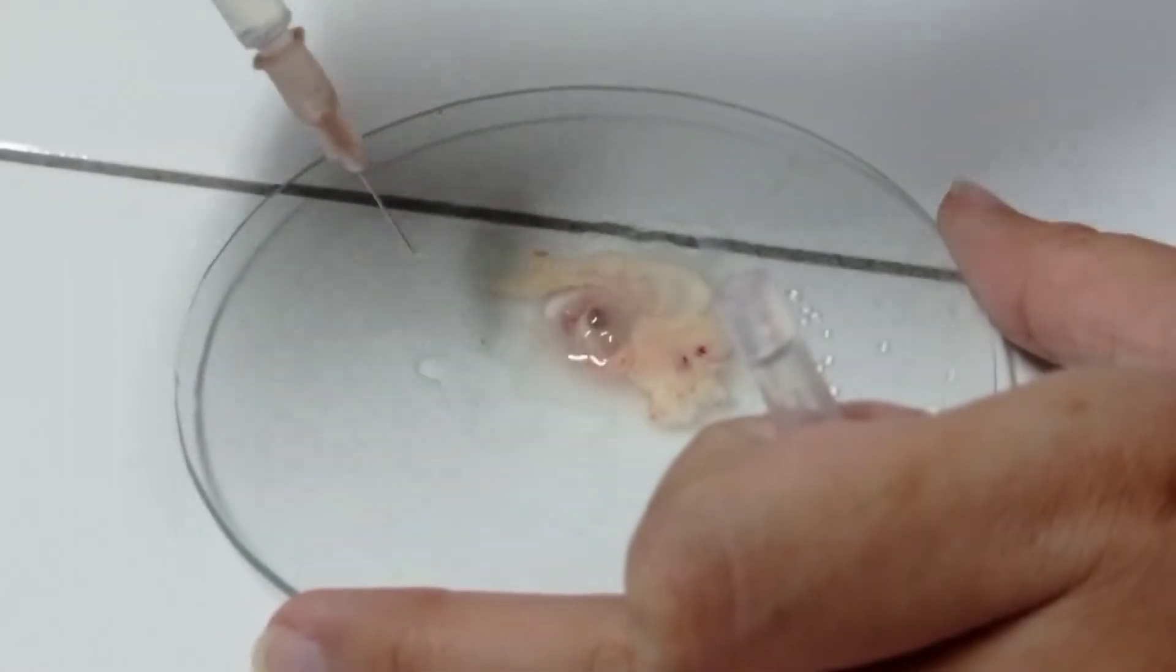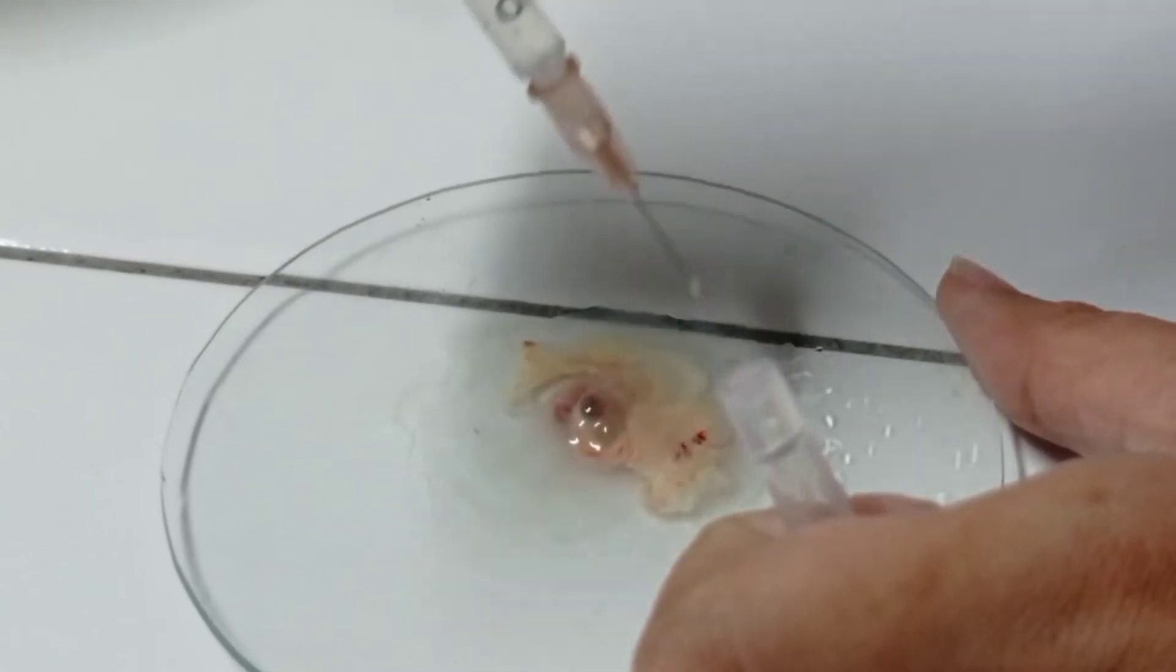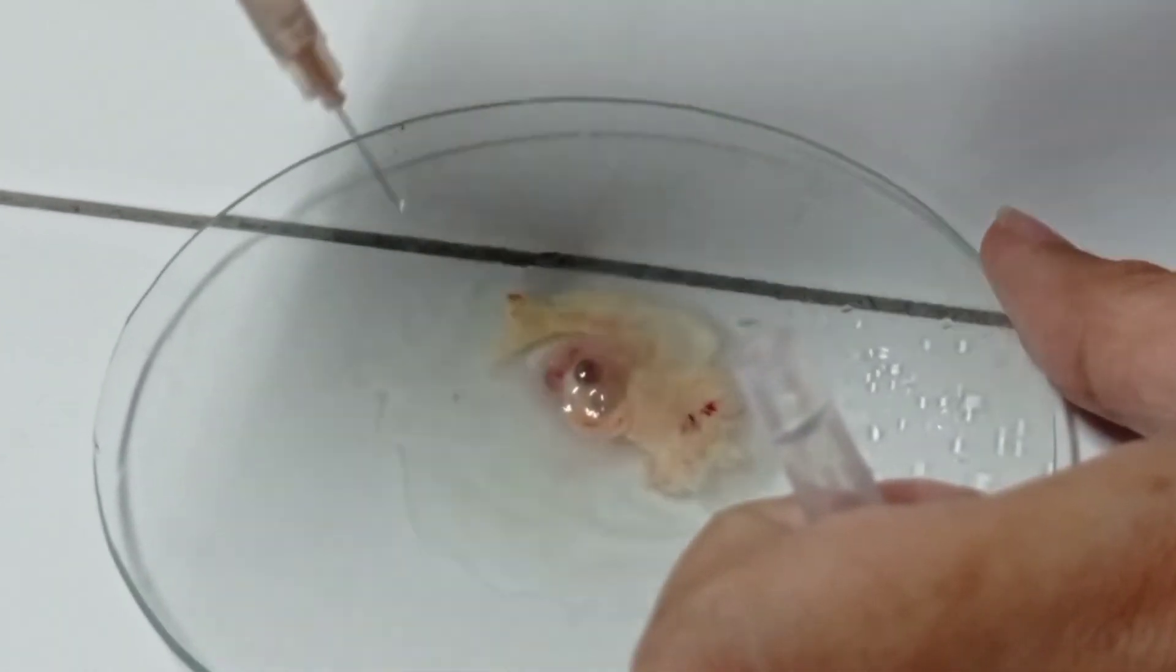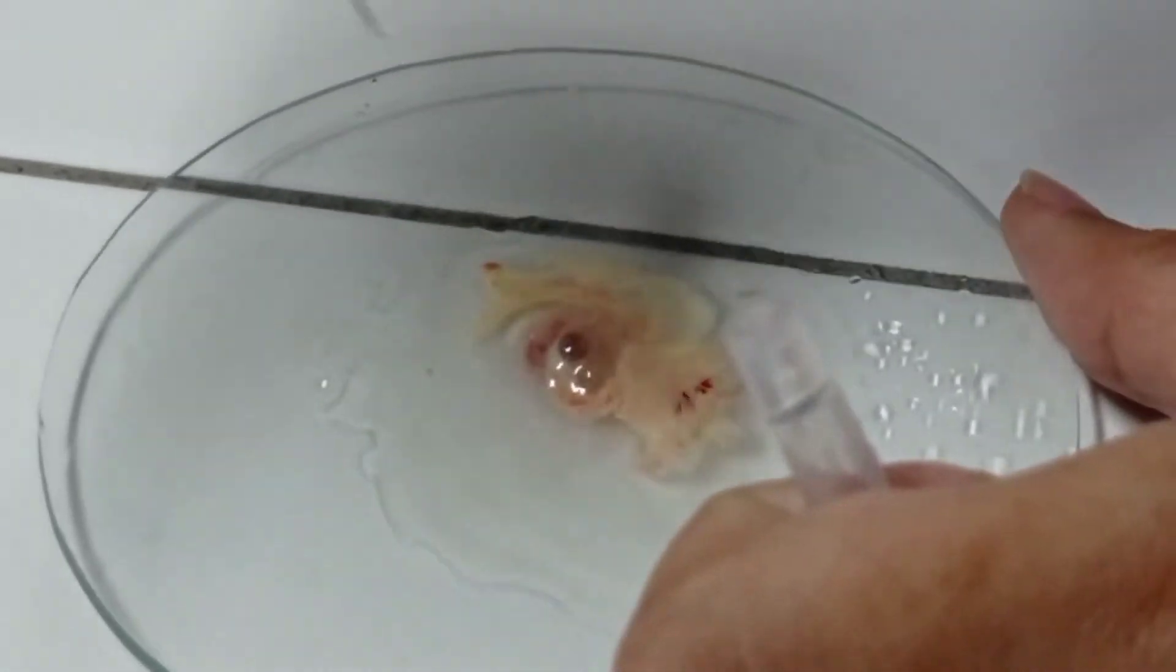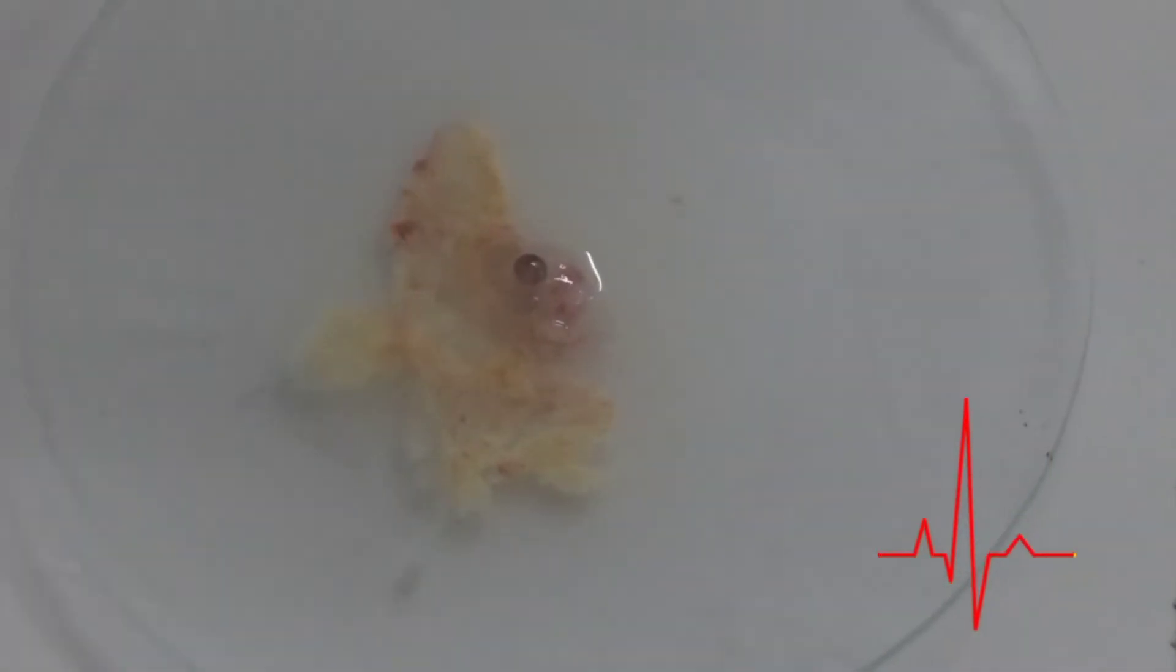Langkah ke delapan, yaitu pemberian garam fisiologis yang bertujuan untuk menjaga keadaan sel embryo agar tetap hidup selama dipersihkan dari massa sel lain dan selaput-selaput yang melindungi embryo, serta menyerap massa sel lain seperti albumin dan kuning telur dan memudahkan kita untuk memisahkan embryo dari massa telur tersebut. Setelah pemberian larutan garam fisiologis terlihat denyut jantung pada embryo ayam.